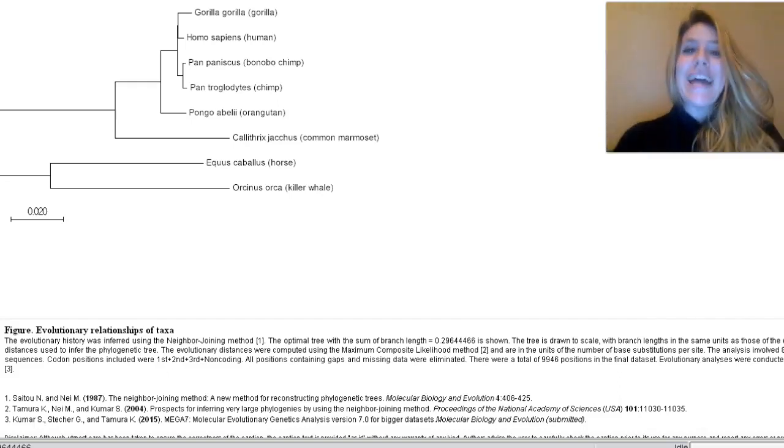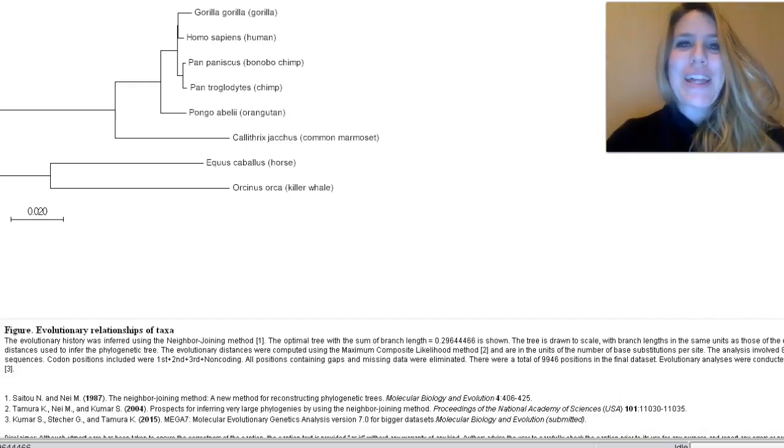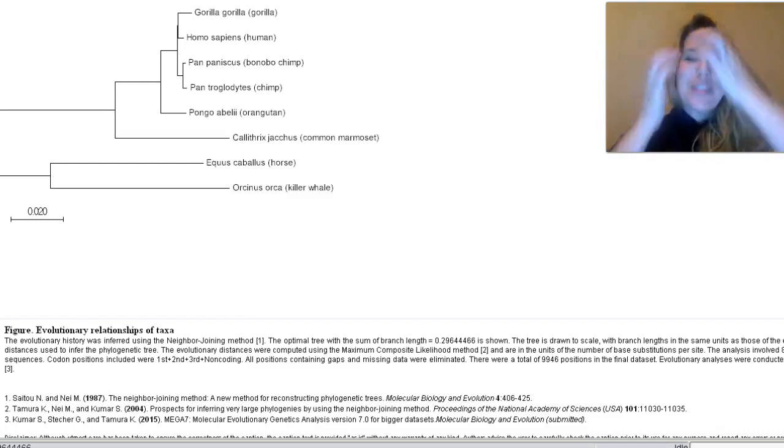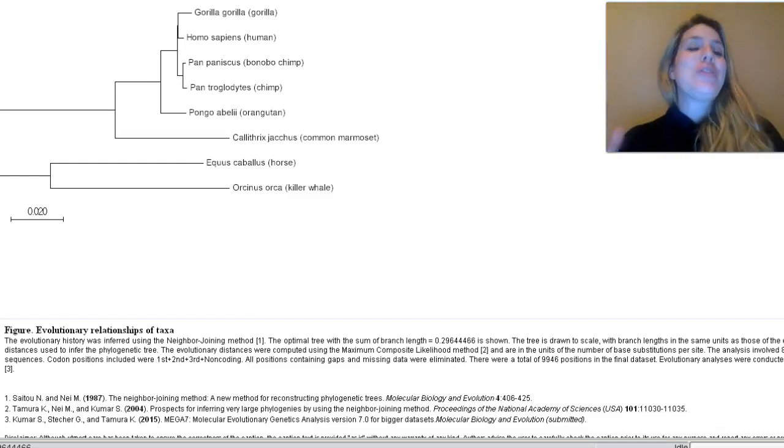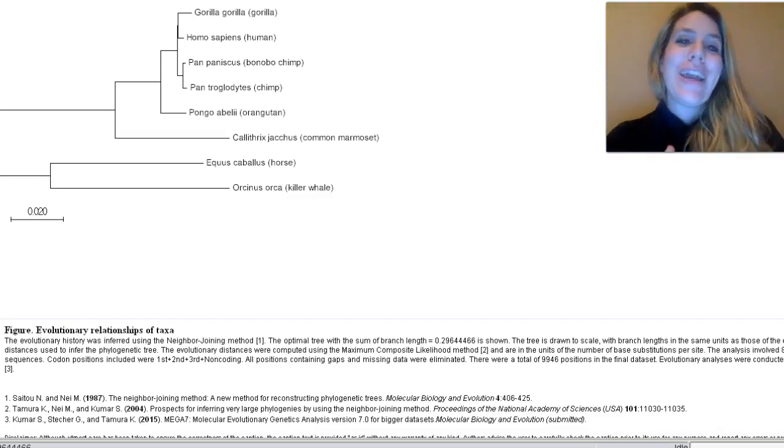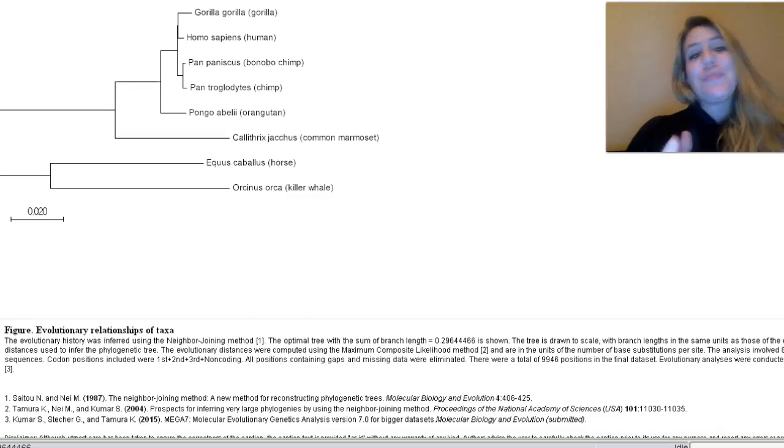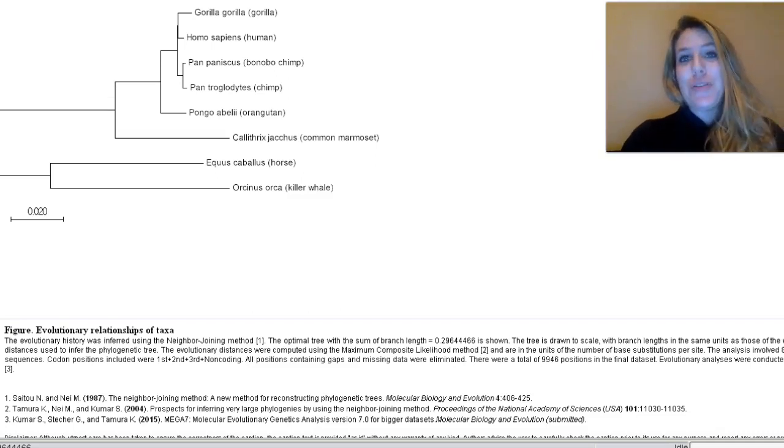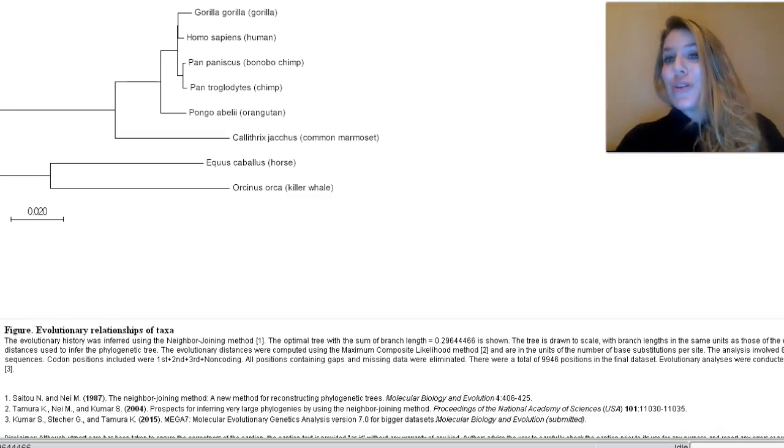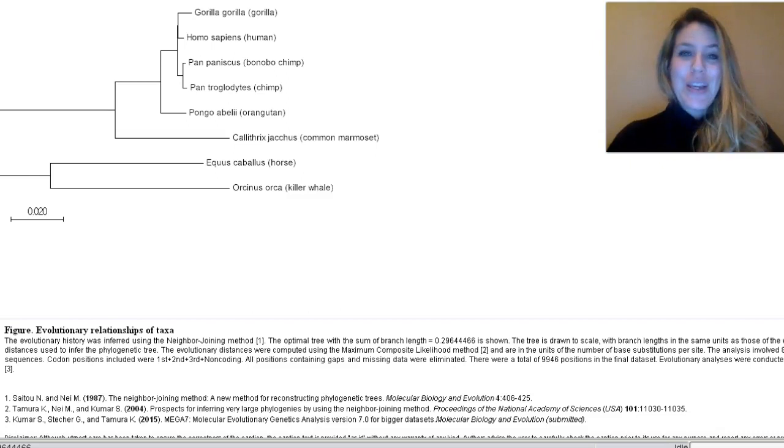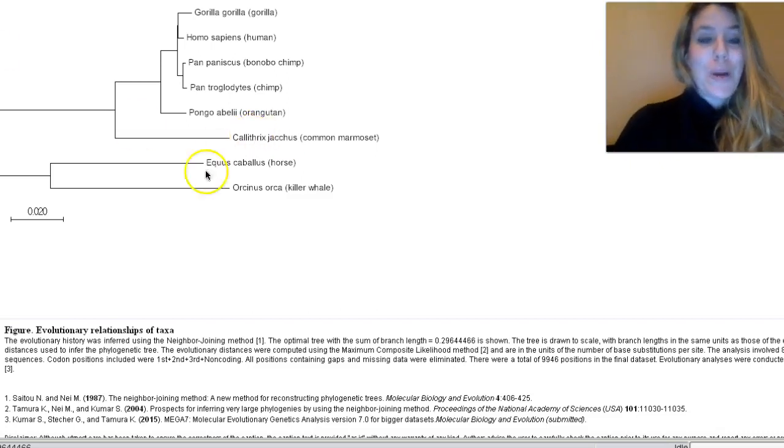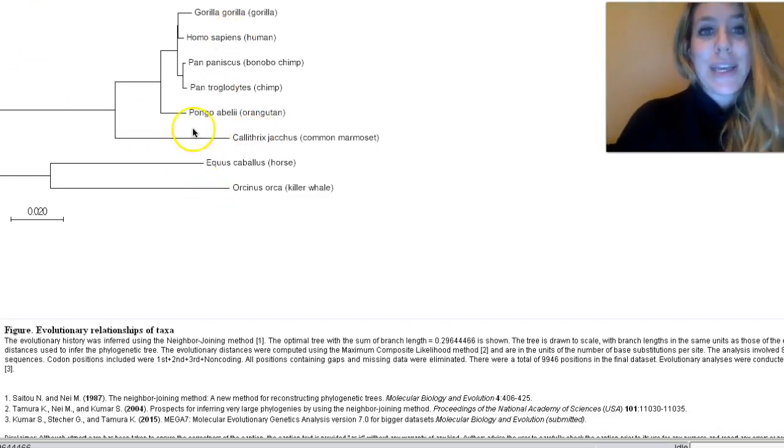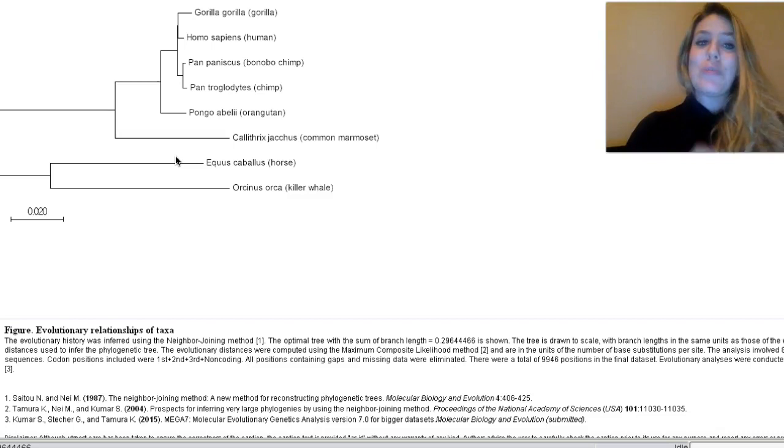Okay, the last segment of our tutorial for doing your mega lab. In this tutorial, we're going to learn how to beautify your tree and put some pictures of the animals on it, and how to look up genes of your own choosing.